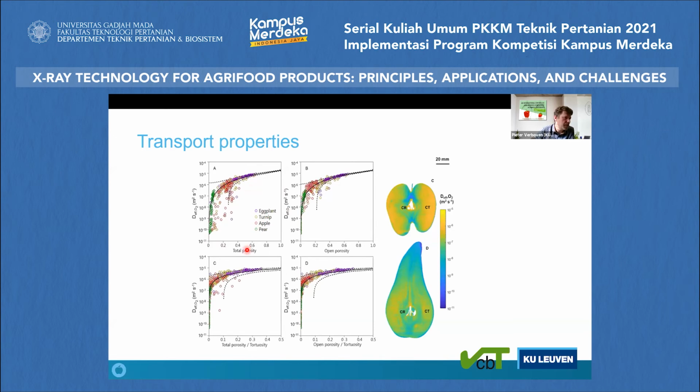But anyway, this can be translated, with our multiscale modeling, into effective oxygen diffusivities, and you see that there's a relationship between porosity and diffusion coefficients. As we saw earlier from the very preliminary measurements that we did 20 years ago, we get confirmation now. But here, all these properties have been computed directly from the X-ray. So we don't need any other methods anymore to determine all these properties. It all comes from the X-ray imaging.